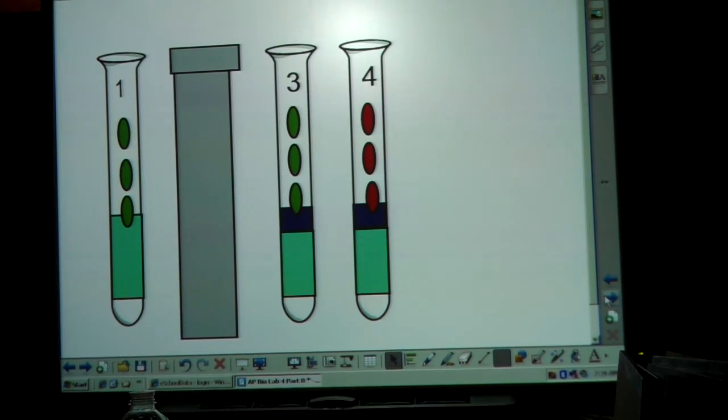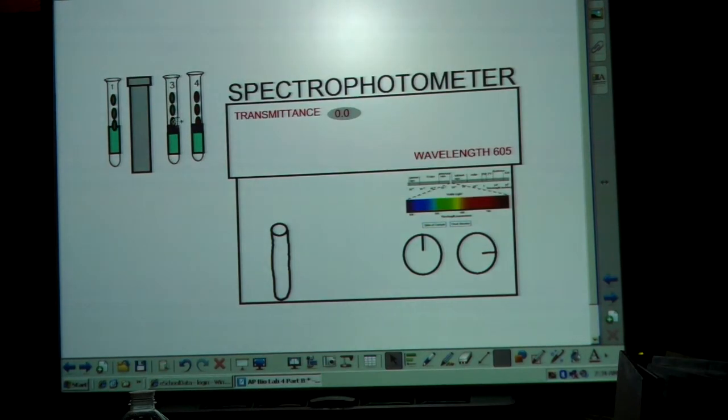Okay, so then what you're going to do, you need to get the measurements here out of the spectrophotometer. To do that, you're always going to use test tube number one to zero the spectrophotometer. First thing you do before it gets turned on, before you put any test tubes in, you make sure it's set to zero. Then you take test tube number one, you're going to slide it right in the slot. And sometimes it takes a little bit of pressure to get it down there, but you get it in there.